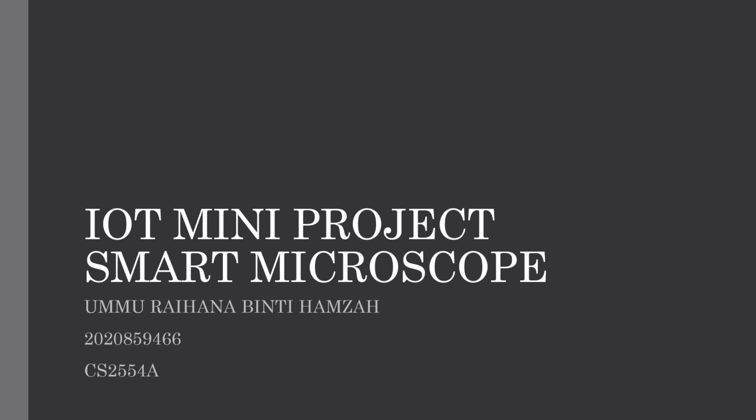2020-859-466. I am from group CS2554A and I'm going to present about my IoT mini project, that is the smart microscope.